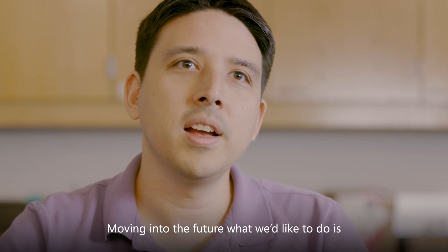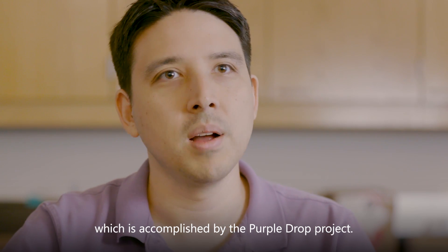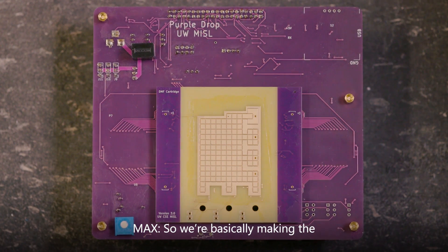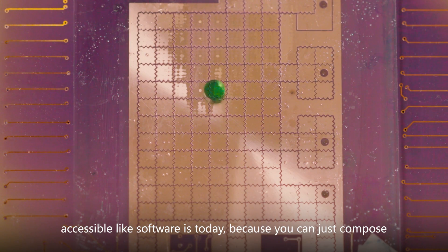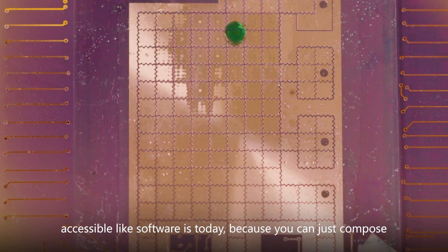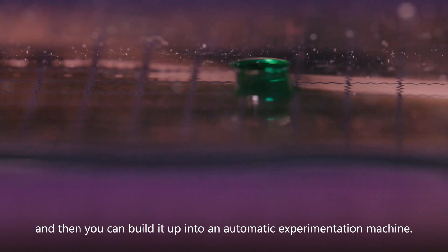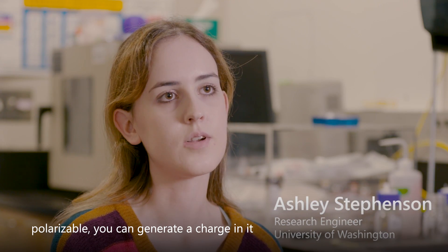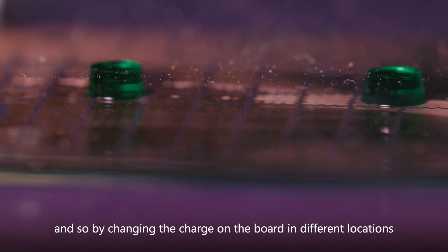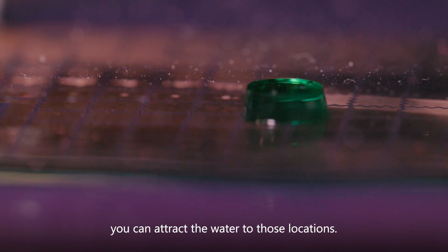Moving into the future, what we'd like to do is move fluids around in a more intelligent way, which is accomplished by the Purple Drop project. We're basically making the biological primitives — moving and mixing droplets — accessible like software is today, because you can just compose it as much as you want. You can start with simple systems and then build it up into an automatic experimentation machine. Because water is polarizable, you can generate a charge in it, and by changing the charge on the board in different locations, you can attract the water to those locations.